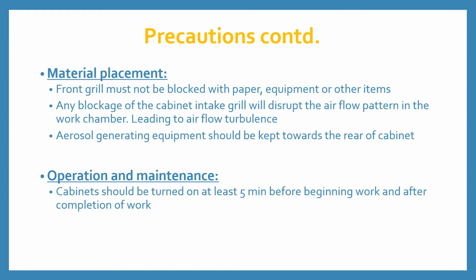Placement of materials. The front grille must not be blocked with paper, equipment, or other items. Any blockage of the cabinet intake grille will disrupt the airflow pattern in the work chamber, leading to airflow turbulence. Aerosol generating equipment should be kept towards the rear of the cabinet.